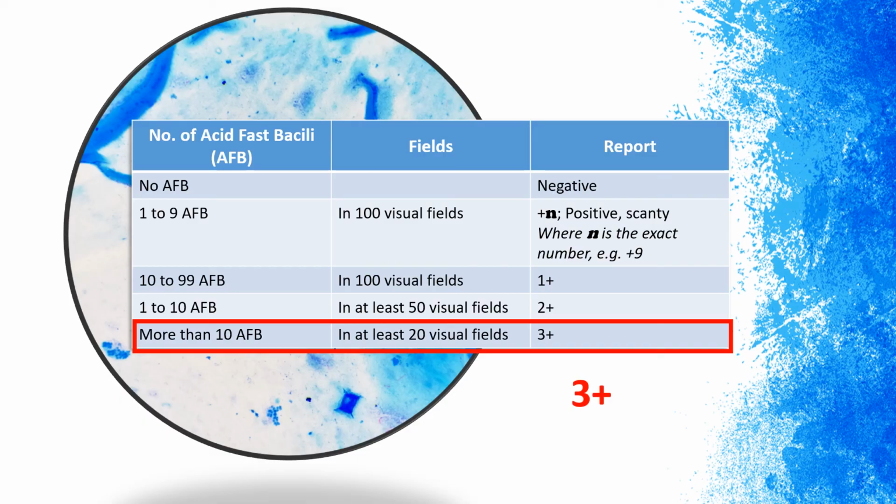So that's how you do your acid-fast staining and the reporting of AFB. I hope you learned something from this session. Thank you.